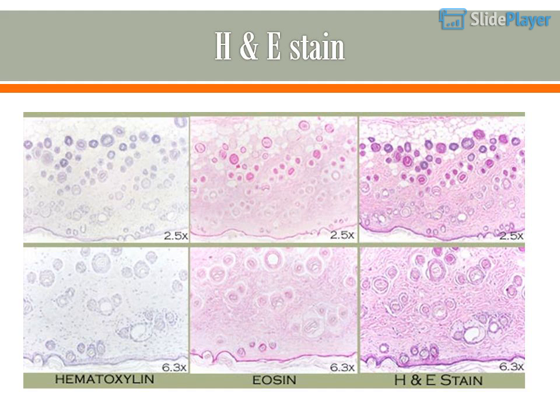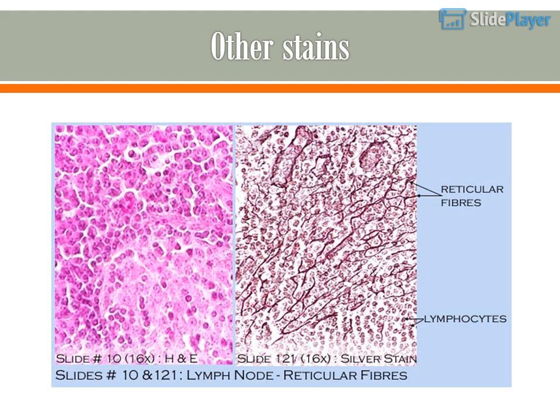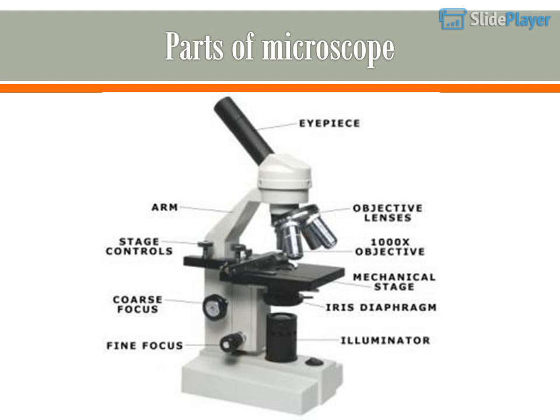H&E stain. Other stains. Tissue processing. Rough endoplasmic reticulum. Parts of microscope.